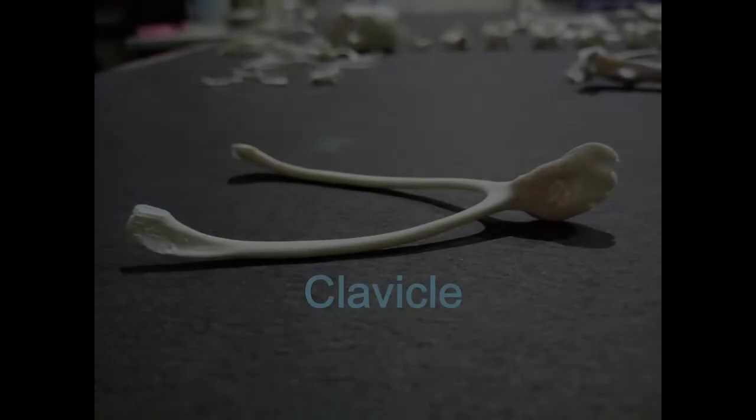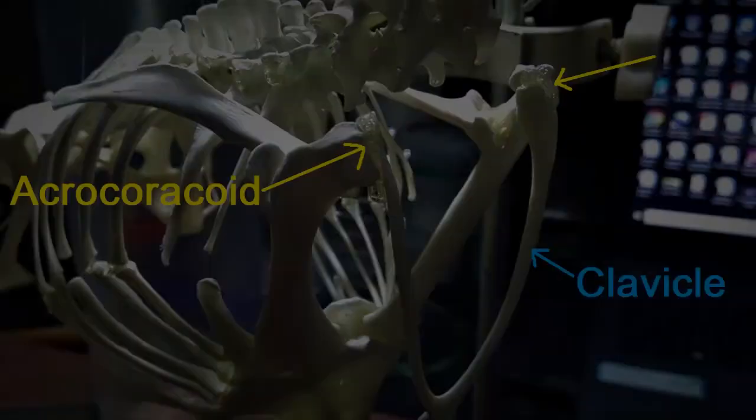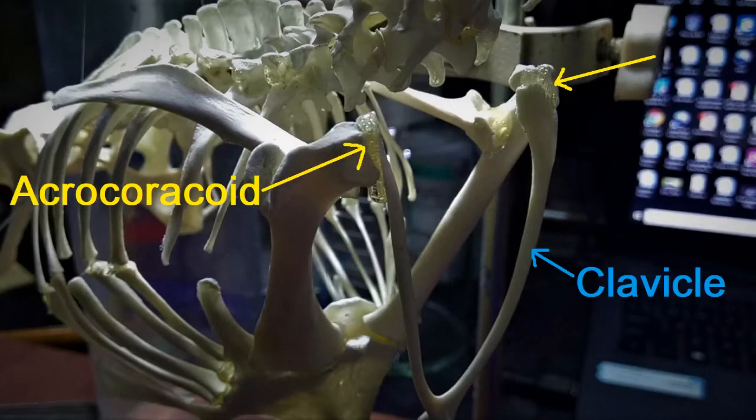We now move on to the clavicle bone. This is a V-shaped structure with a bilaterally flattened rounded end called the inner clavicle. This flattened end protrudes slightly on one side and less at the other. The protruded end will face the back side, towards the thorax, and the less protruded end will face the front of the body. Following this pattern, glue the clavicle onto the acrocoracoid process of the left and right coracoids like so.